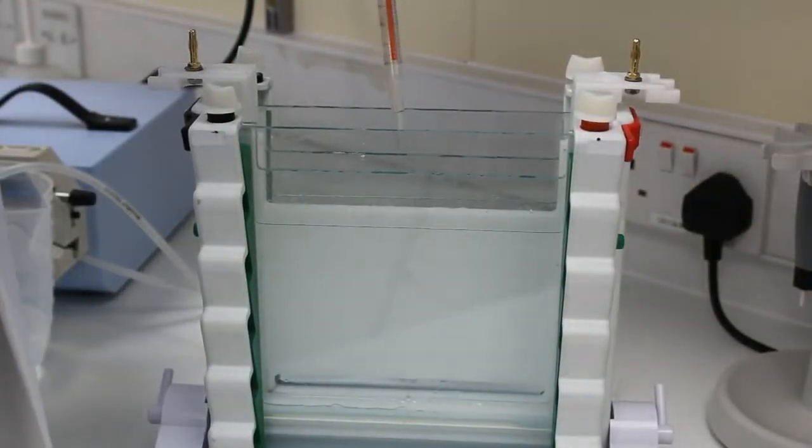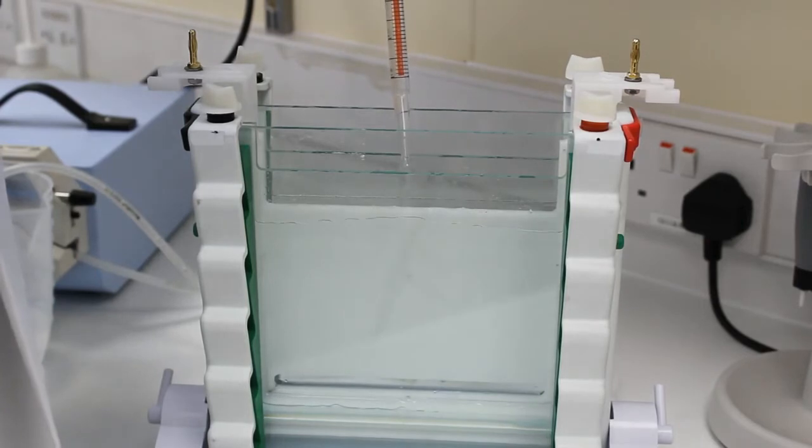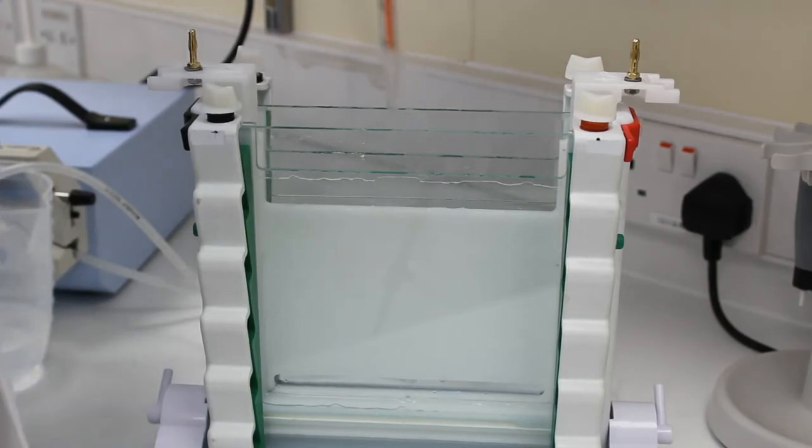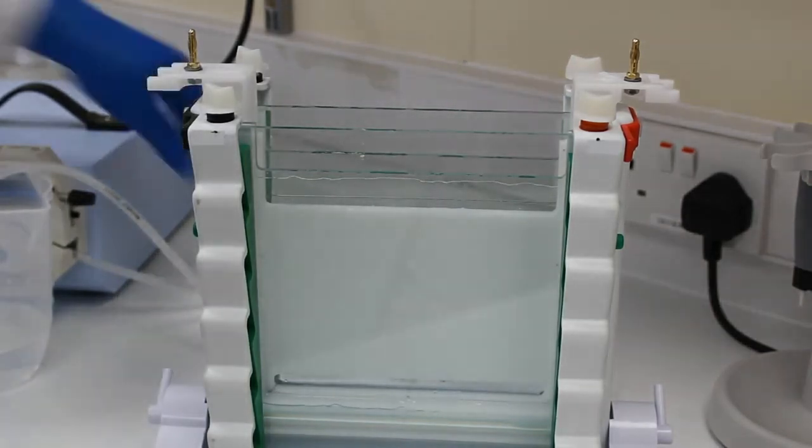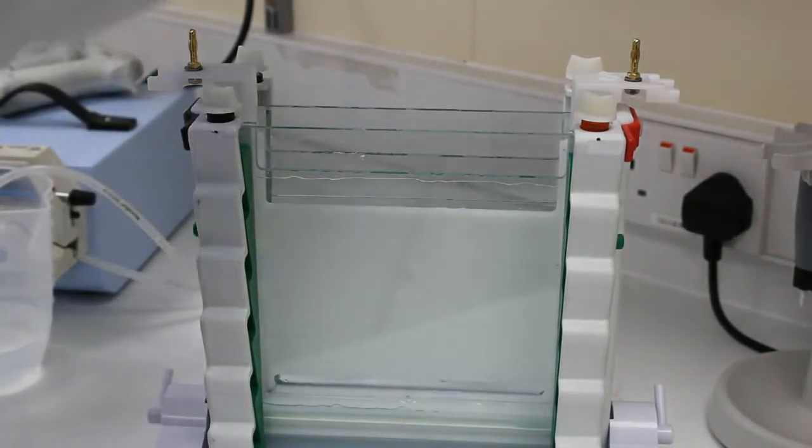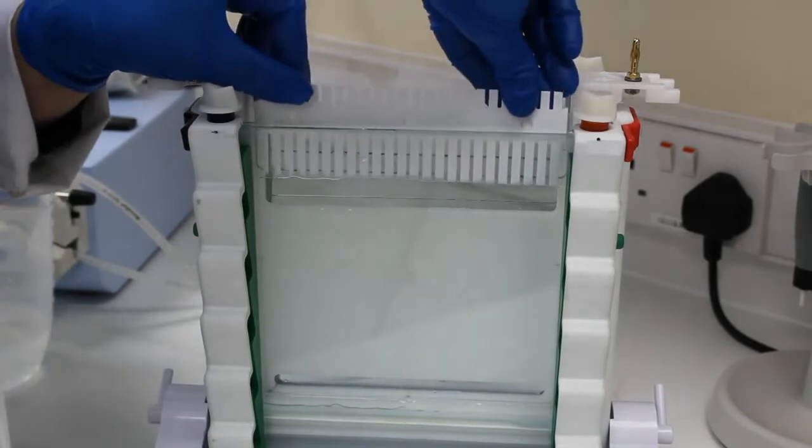So for this particular gel we've also made a stacking gel that we're adding on top of our gradient gel. And that's where we're going to insert our combs in. So that stacking gel is a 0% denaturing gel, otherwise it's essentially the same as the rest of the gel.